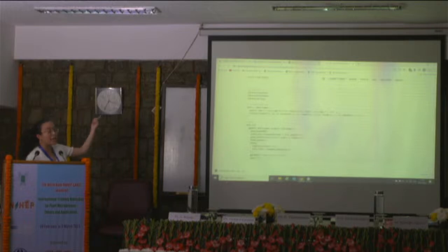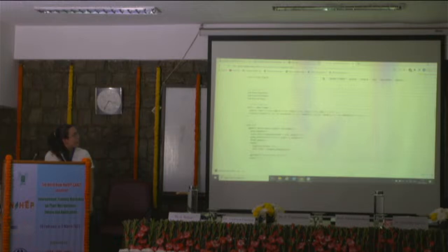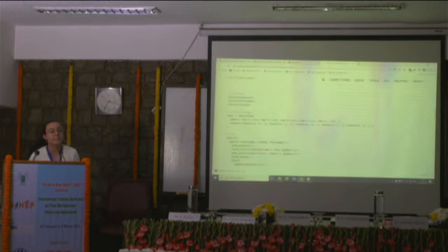So for example, look, this is the code that they're using, and I think you should already know some things in here. So library, we saw that that's the way you load a package, right? So they're loading some packages over there, and then they create the data set in the same way we did. So they have a name. I'm going to do it with the cursor. Like, can you all see it? Yeah? Okay. So they have the data frame function, which we used. And then they have vectors.